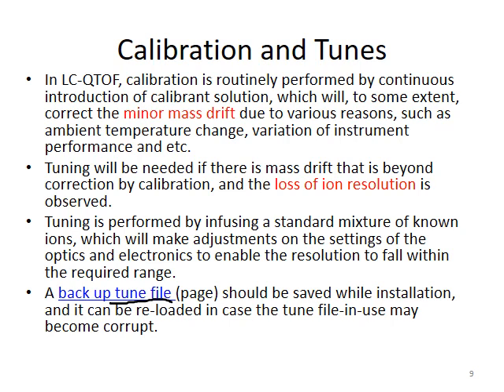A good practice is that there should be a backup tune file when your instrument was initially installed. Any further changes made to the tune file should be saved as a separate one. This is because at times the tune file might be corrupted, and you should have a backup file to retrieve all the settings from when the instrument was first installed.